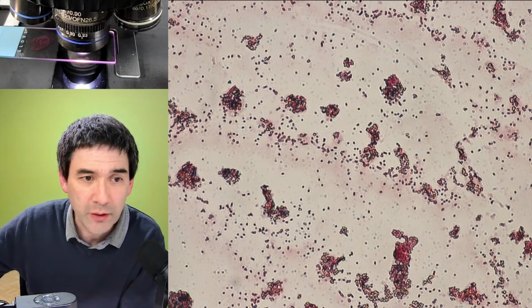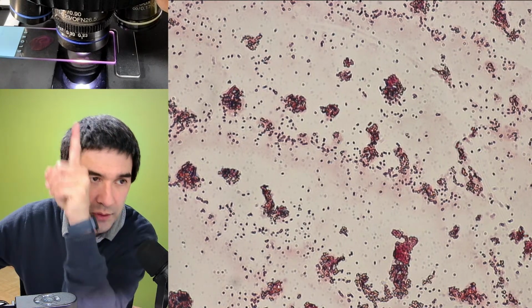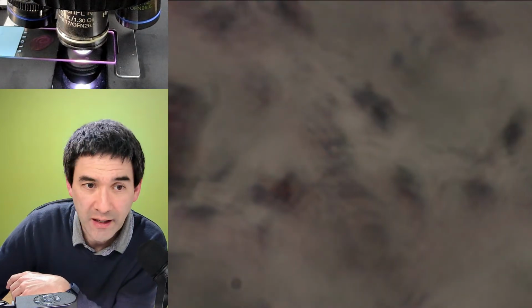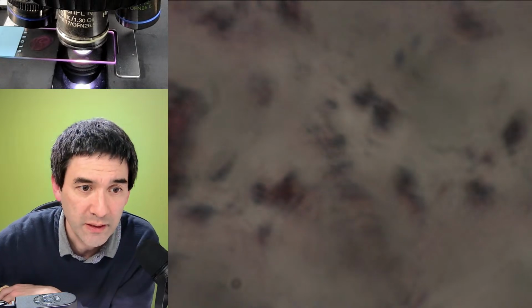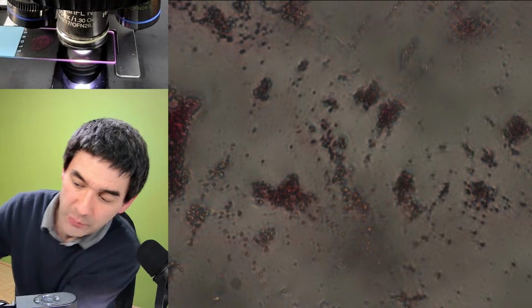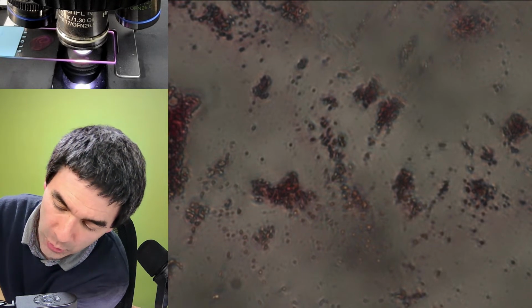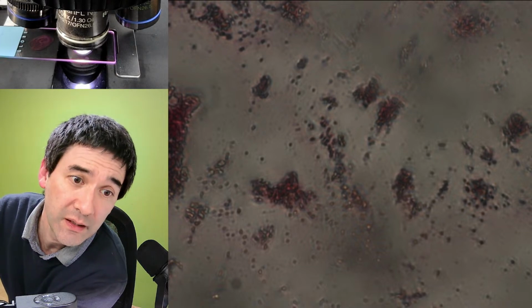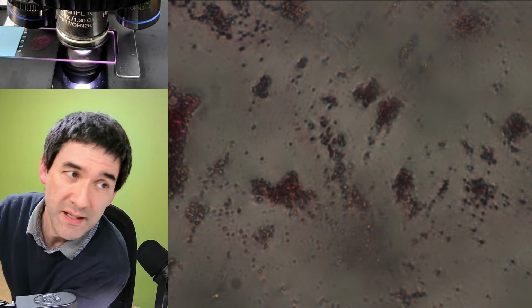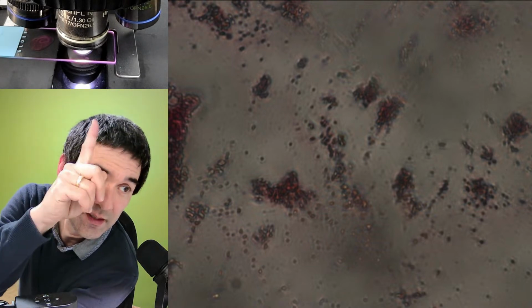For oil immersion microscopy, you might want to check what I'm doing here at the top. Without immersion oil, I try to get the focus, and it's kind of blurry, right? My microscope has this focus lock lever. I'm now setting it, so it will remember the position. Look what happens.